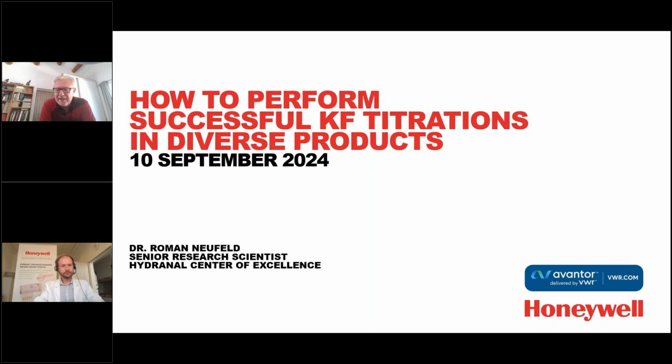I'm Didier Sampere, working in the global marketing Avantor organization to push and promote chemicals and chromatography products. I'm sure you will agree with me that water determination by Karl Fischer method is certainly one of the most common methods used in the analytical labs for many different substances. But to perform this complex method, you need to avoid some mistakes. And today we will present a webinar called How to Perform Successful Karl Fischer Titration in Diverse Products.